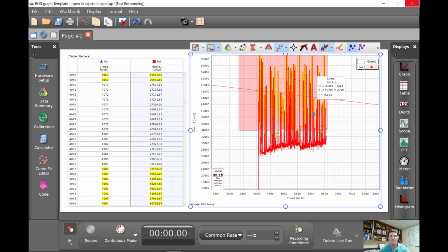So what you're going to see is the program will think. Again, mine's running a little extra hard right now with the video recording and everything added, but it's going to think and these data points won't be included. What you'll notice is it's still not going to work super well. I'm going to need to zoom in really well to get a much better value here. So we'll pause, and once this comes back, we'll zoom in and show you how to do that.